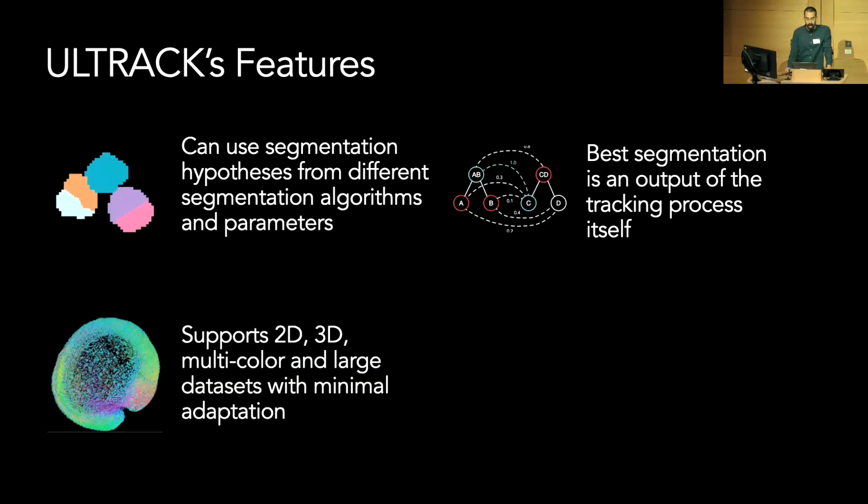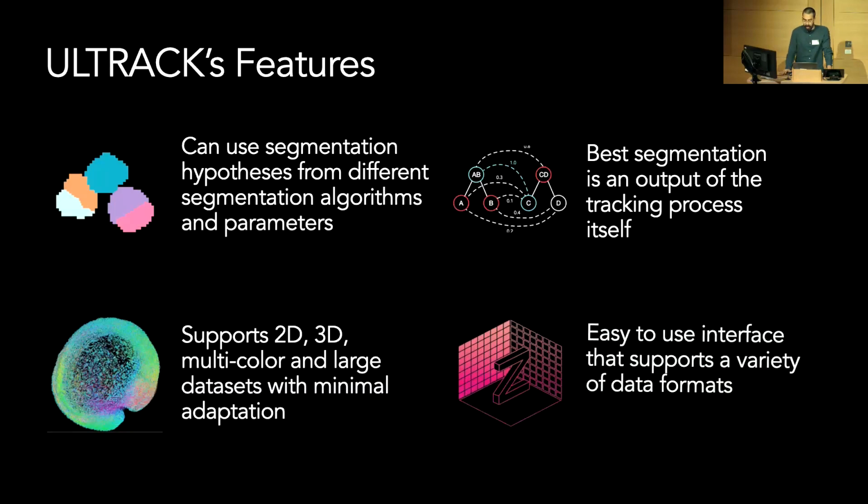Our software also supports 2D, 3D, multicolor, or data sets that are larger than memory. And what I mean by supporting is going beyond just being able to use it: we also provide some functionality so you're able to extend the existing algorithms you have to these different modalities. And also we have a simple Python interface. So if you have any format that is compatible with NumPy, Dask, or Zarr, you should be able to use it to track your data without having to duplicate your data set.